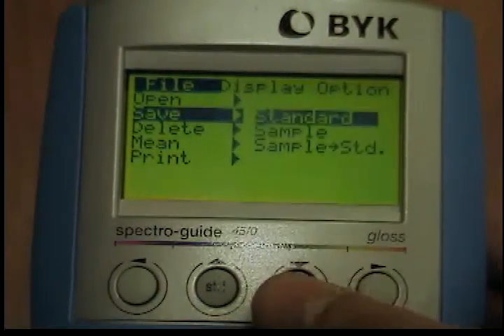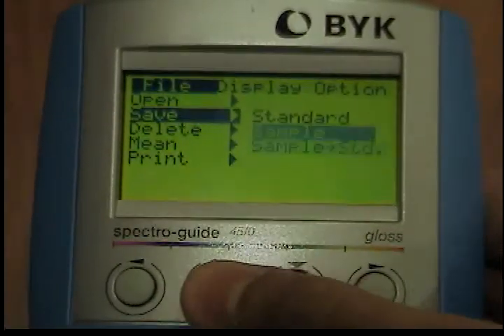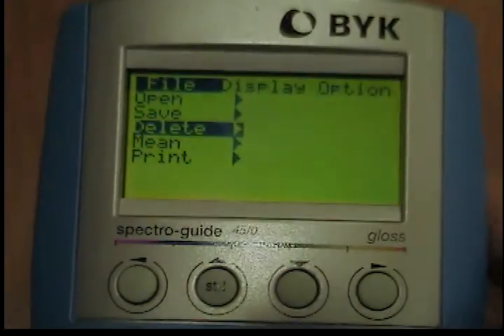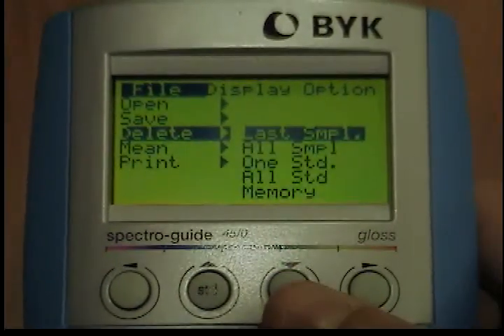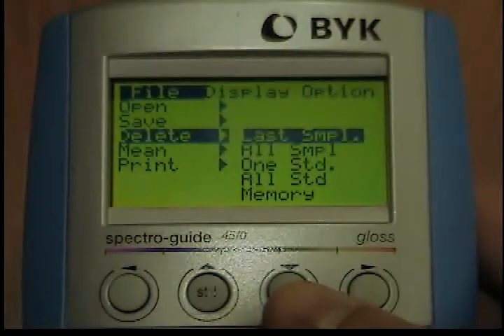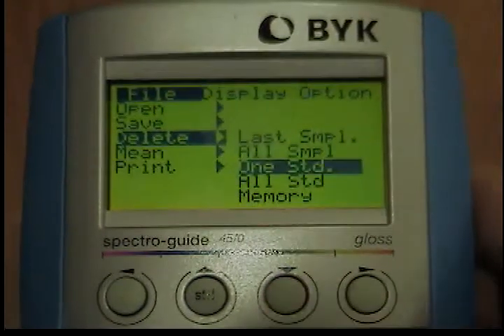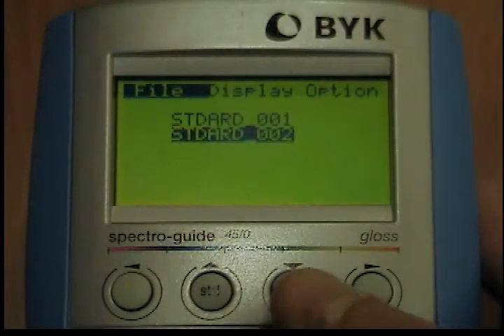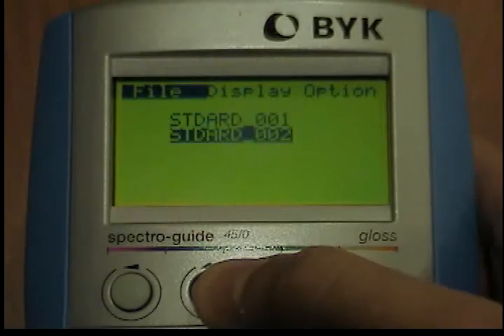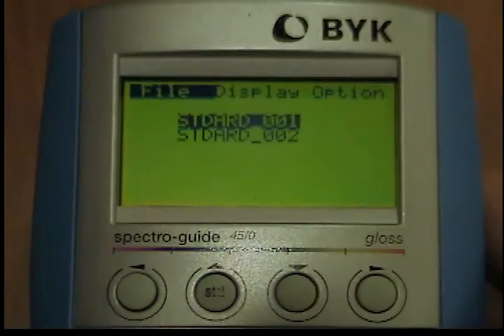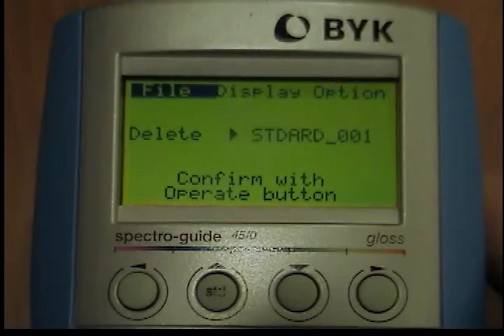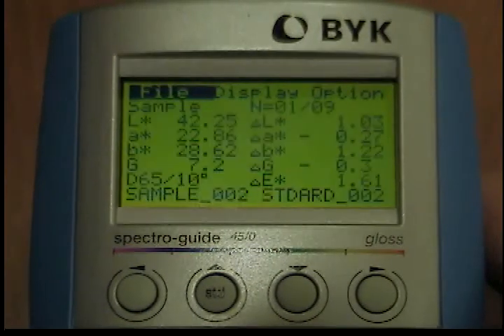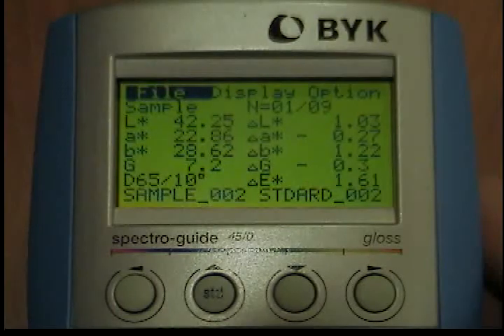Delete File — example: One Standard. From the File menu, use the Down button to move the cursor to the Delete option. The submenu will open when you press the Operate button. Use the Down button to move the cursor to One Standard and press the Operate button. The selection menu will appear for the standard name. You can use the Up and Down buttons to select the standard you wish to delete. When you press the Operate button, a prompt will ask you to confirm that you want to delete the selected standard. Confirm your selection with the Operate button and the standard will be deleted.